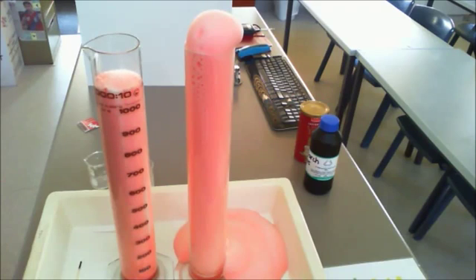So effectively what a catalyst does is speed up the rate of the reaction. It doesn't get consumed, which means that we'll still have our yeast at the bottom there, and we can reuse that if we simply keep adding more and more hydrogen peroxide in this case. Once again, please fill in the prac write-up, write your conclusion, and then see your teacher if there are any problems that you have.